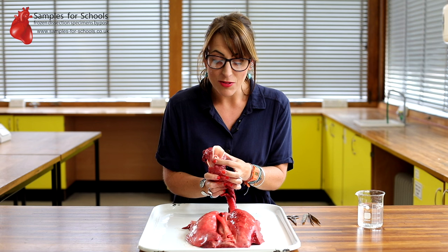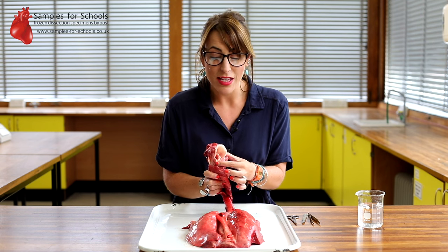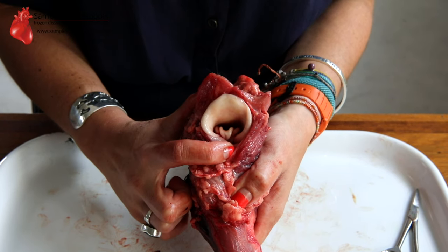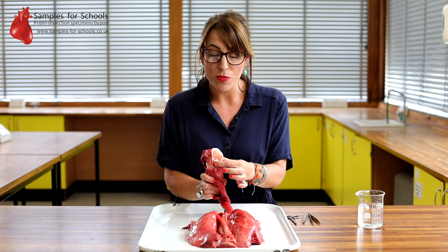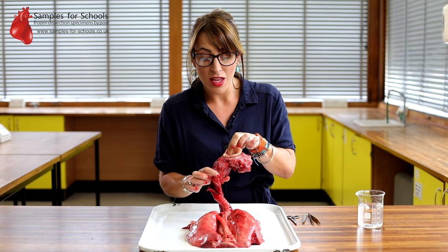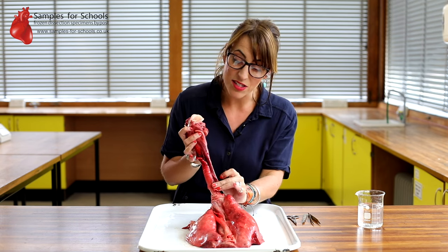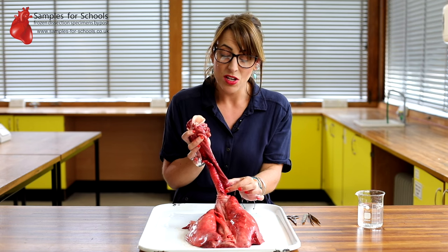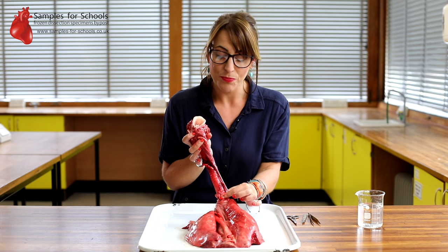And we've got this ingenious little flap-like area here, which we call the epiglottis. This is for when the animal is eating; it can close the entrance to the trachea to stop any food debris going down the trachea into the lungs. That is because running completely adjacent next to the trachea is the esophagus, the pipe that the food bolus travels down into the stomach.